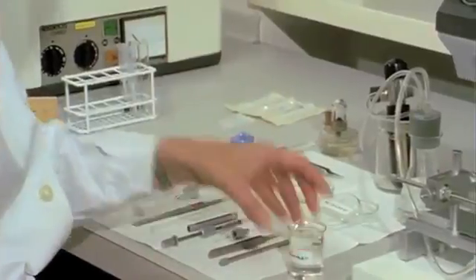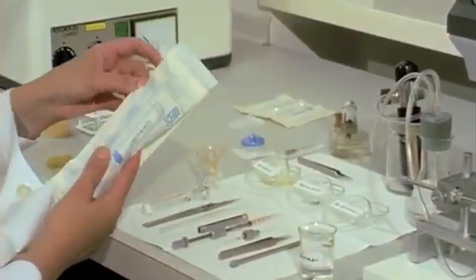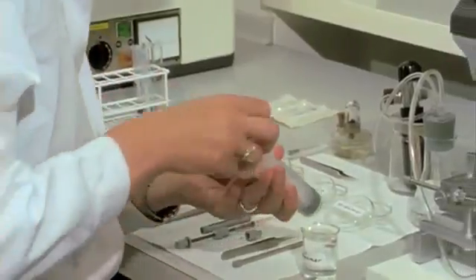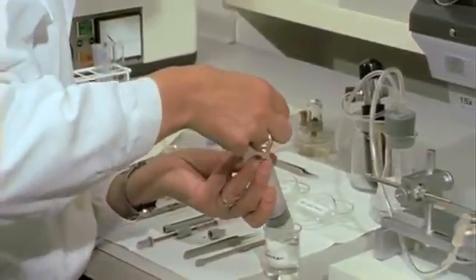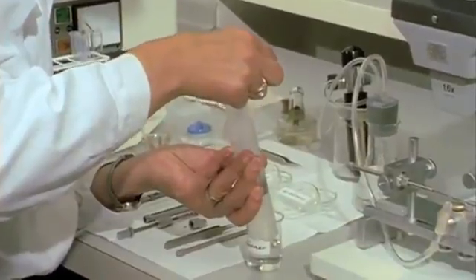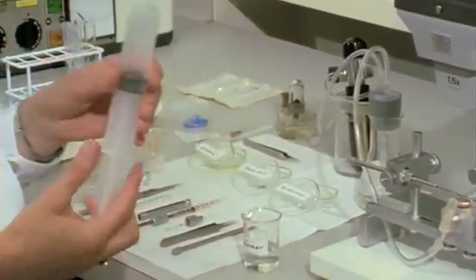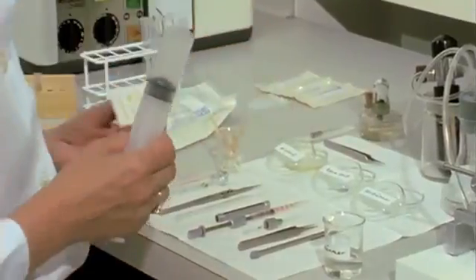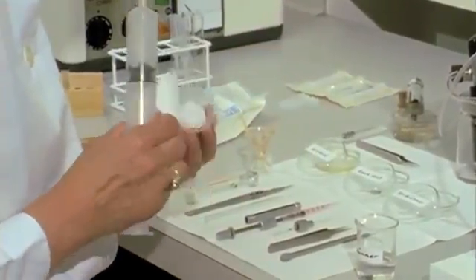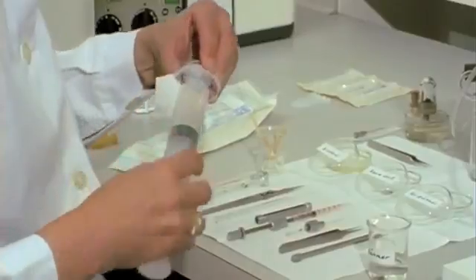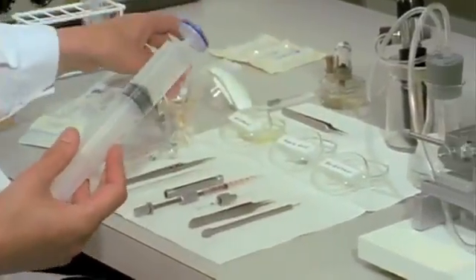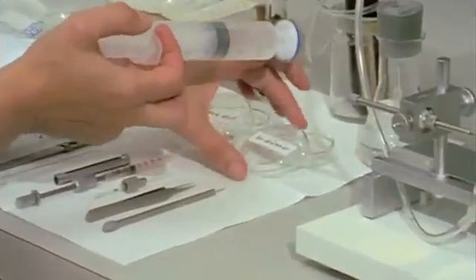In preparation for semen collection, a semen diluent—for example saline solution or, as here, Tris buffer—is drawn up. The liquid is sterilized by microfiltration. The pore diameter of the membrane is 0.2 microns.